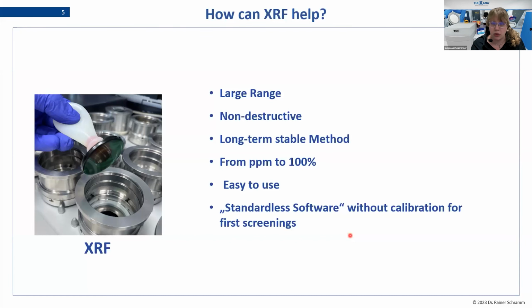and you can really use it greatly for semi-quantitative and qualitative screenings. So if you really don't know what's inside your sample, you can measure it and evaluate with a standardless software, and then you will have at least an idea of what is inside your sample without having the effort to calibrate in the first place.